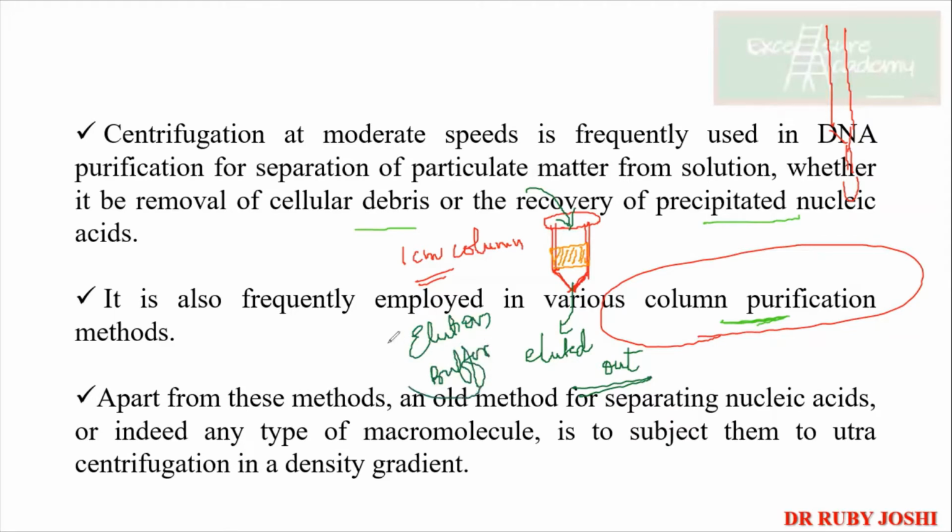Okay. So this elution buffer, after this, the debris which I don't want, it's removed. Another, I will add this elution buffer and it will come out. So in the next round, whatever comes over here, it has got my interested sample. Okay. This I will collect and start doing my experiment.